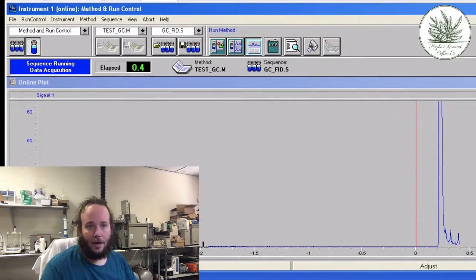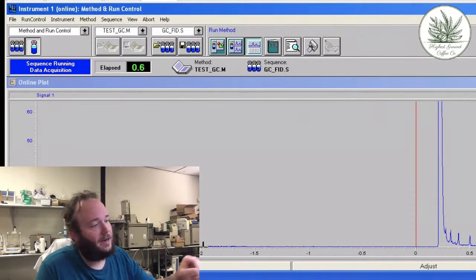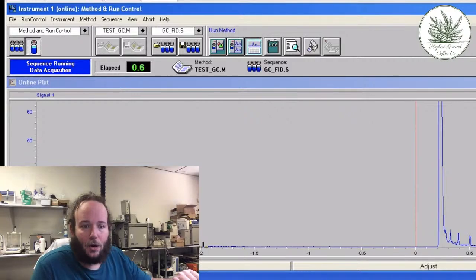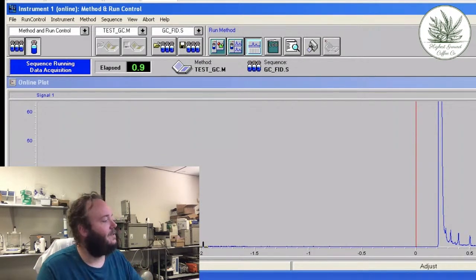So I think tomorrow, hopefully there's no errors that prevent this from running tonight, we'll come in and show how the actual calibration process or the quantification process works. I'll show the spreadsheet that I use, pop in the data, and then quantify it. And then y'all can see what a ridiculous amount of work it is to run a test.